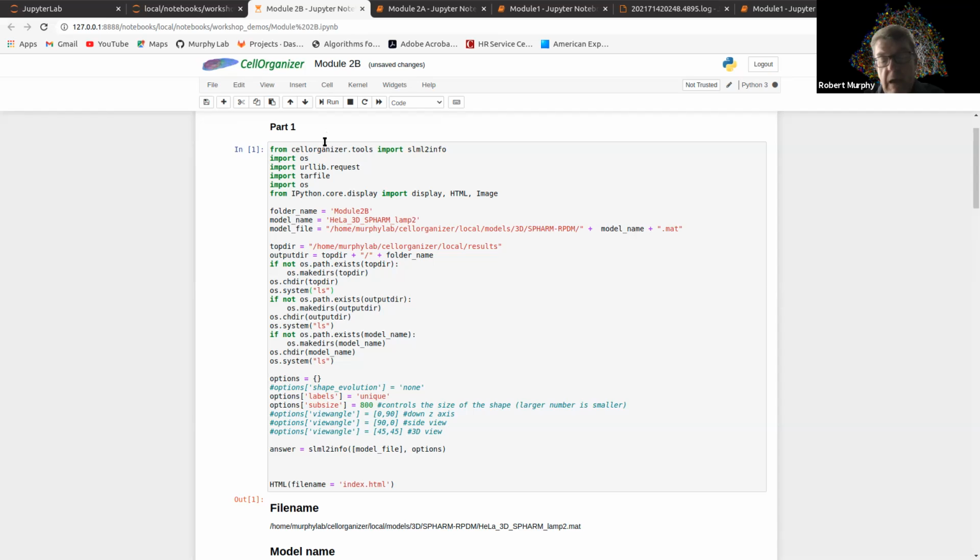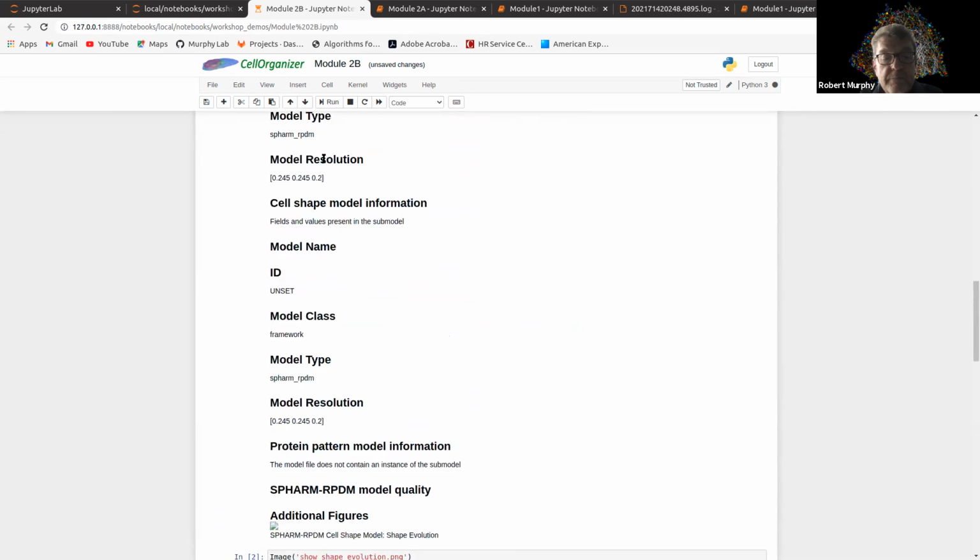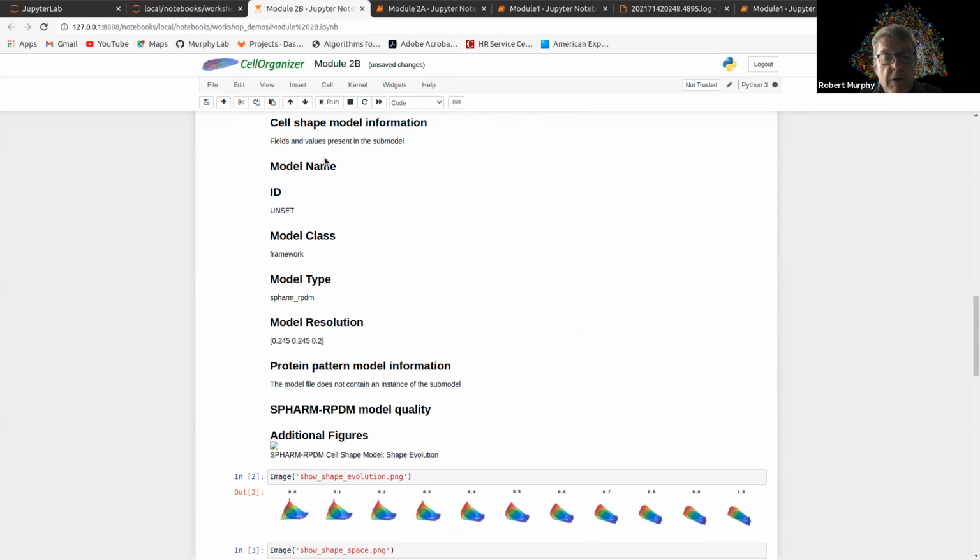It has the same information we just talked about, but it will also generate various example images. So here it's generating an example shape evolution from the first cell to the second cell, right? It just does an illustration, and there are options that will let you set whatever cells you want to display there. That's to illustrate the synthesis of images in between.